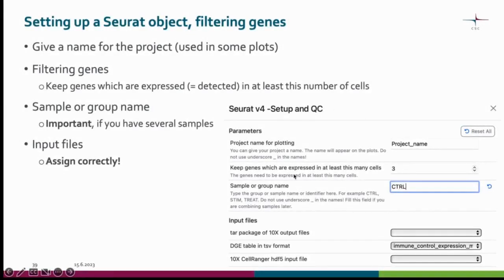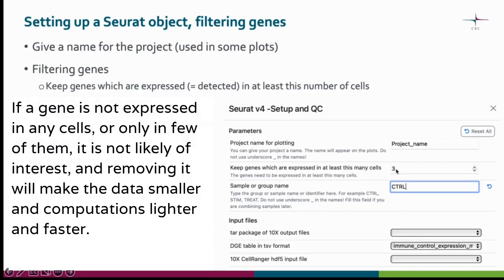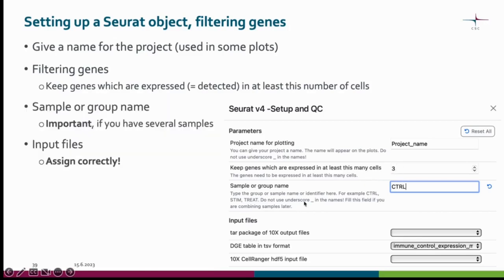In the parameters tab of the Seurat version 4 setup and QC tool, you can give a project name used in the plotting, and choose in how many cells a gene must be expressed in order to keep it. When you have several samples, it's crucial that you name the sample in the sample name field. Please don't use any special characters in the naming as it might disrupt the code. In the input file section, make sure you assign the files correctly — if you have the digital expression matrix in CSV format, choose that option.